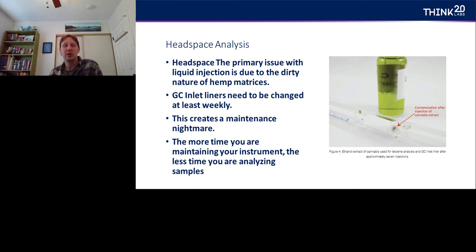I've heard from certain labs, they change them every 25 to 30 samples. So this kind of creates a production nightmare. So Headspace is a much cleaner technology. I've heard of labs not cleaning their source or doing any sort of maintenance in this regard for multiple years with the total evaporative analysis Headspace technique.